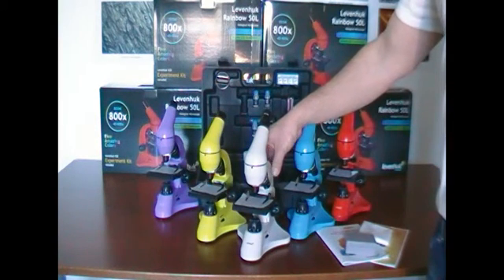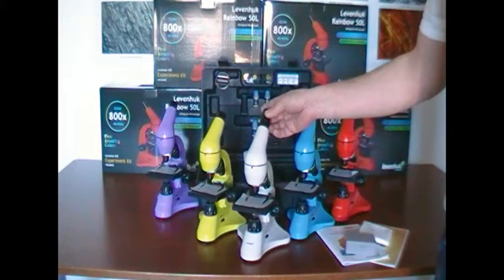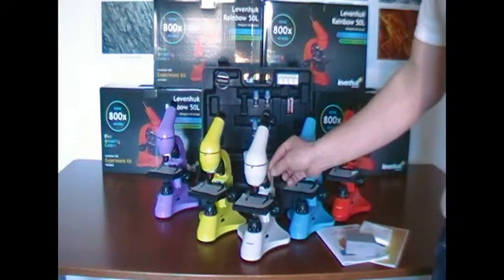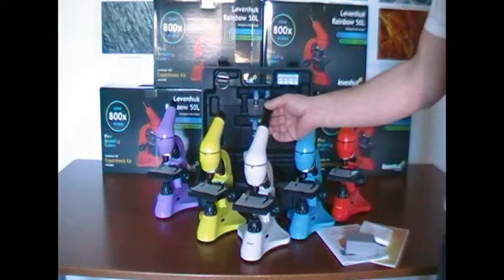This microscope has a solid, durable plastic body, a 10x eyepiece, three objectives offering a magnification of 4x, 10x, and 40x installed on a revolving nosepiece. It also includes a Barlow lens.